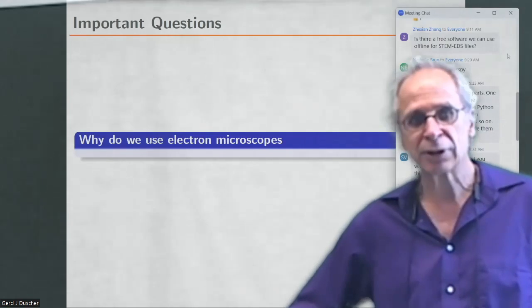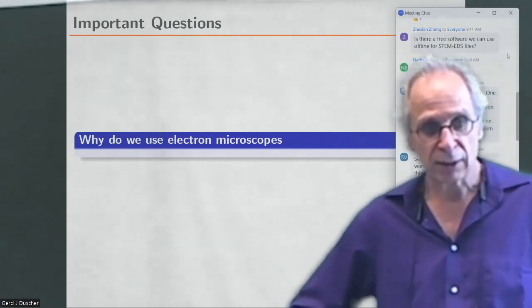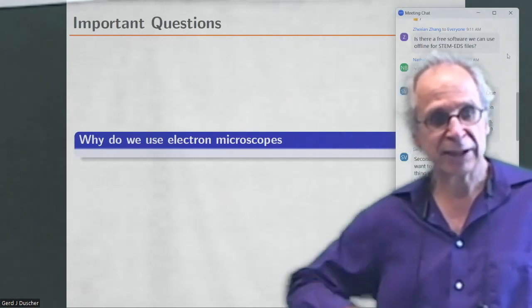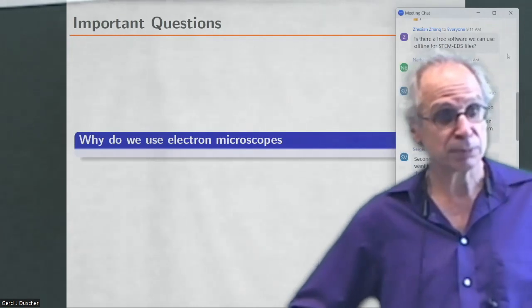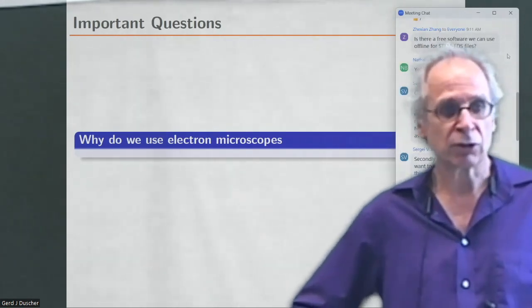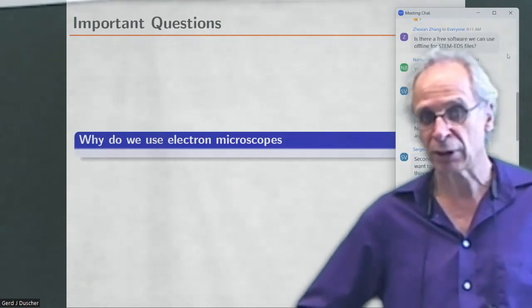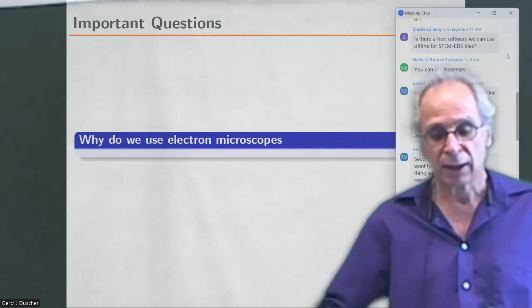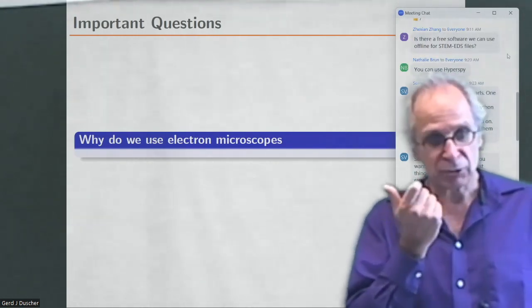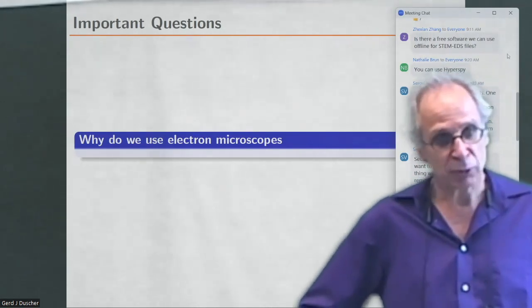If you look in the MSE 672, there is an EDS spectrum part. So it talks about all the different features and how you model those and how you use then that for quantification.